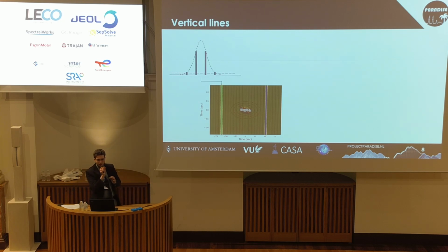However, because in simulations we can move our peaks in such small intervals, smaller than the modulation time, you end up with sort of an in-phase modulation cutting or an out-of-phase modulation cutting. And you can end up with a scenario where part of your 2D peak, so one of your modulations, is so tiny that you don't include it. And that's what's happening with these vertical bars.